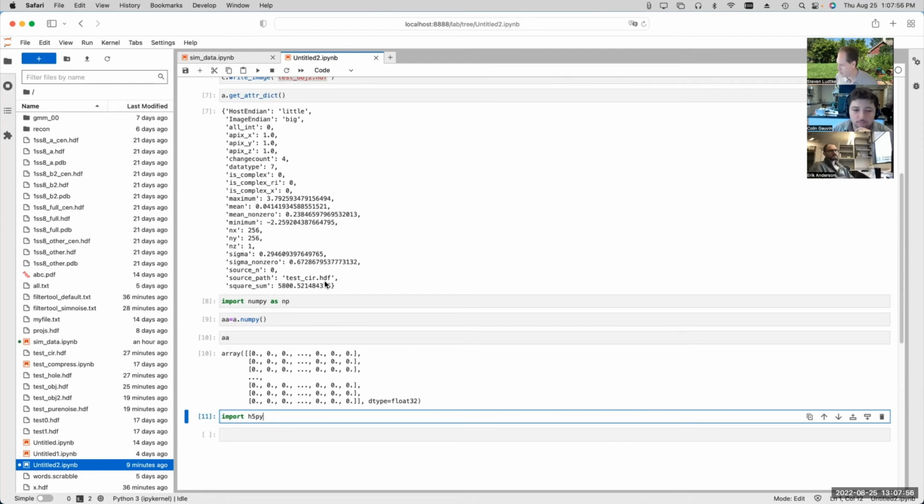There are limits to how compressible that is because it's basically 2 bits of data, and there's nothing you could truncate. At the level of individual frames, it's basically pure noise with a tiny amount of embedded signal that you get when you average the frames together. So you really can't throw anything away with that data reasonably.